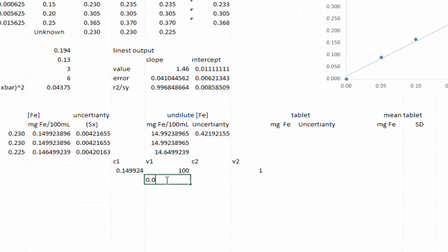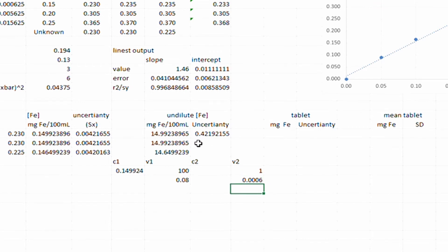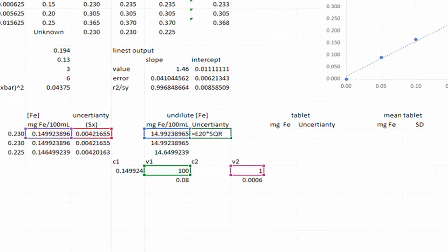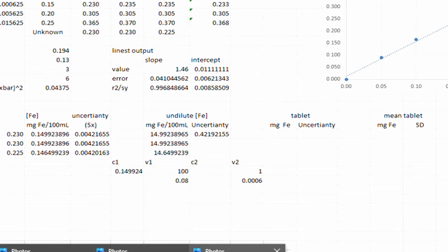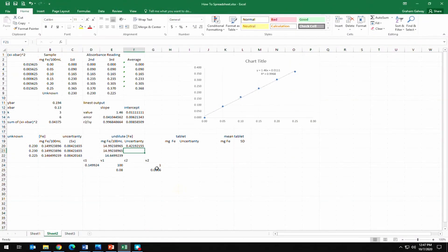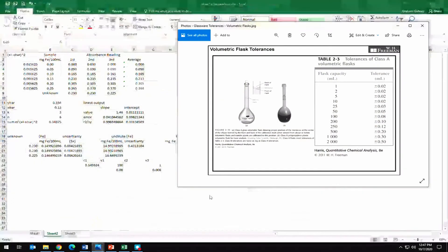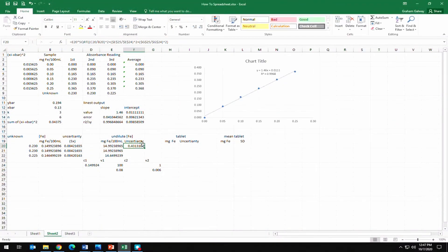One improvement is to put the glassware uncertainties — the tolerance values — as separate cells in the spreadsheet and reference those cells in the formula. This makes the spreadsheet more reusable since you just update the values in one place. Correcting: the 1 mL pipette tolerance should be 0.006 (two zeros, not three) and the volumetric flask is 0.08. With those corrections confirmed, we can copy and paste the uncertainty formula for all three unknowns.